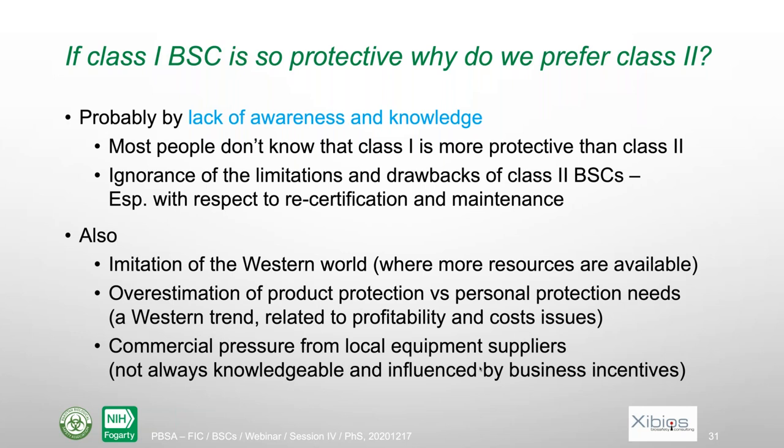Also, most people don't know about the limitations and drawbacks of class 2 biosafety cabinets. And that's especially true with respect to recertification and maintenance. They know that they should be recertified and maintained, but they don't know how important it is, how much it costs, and so on. So I think it's mainly a matter of lack of awareness and knowledge.